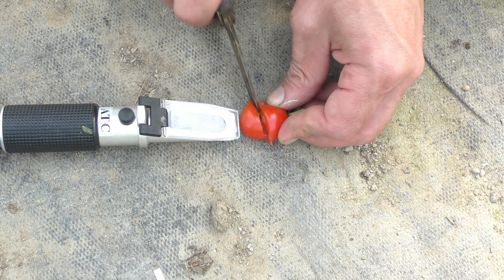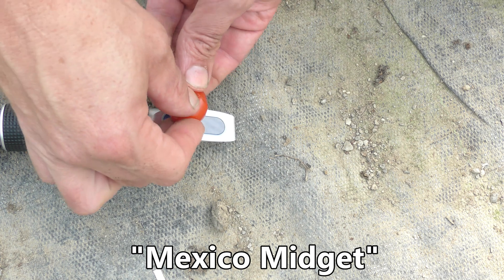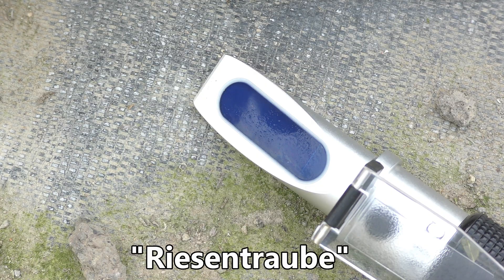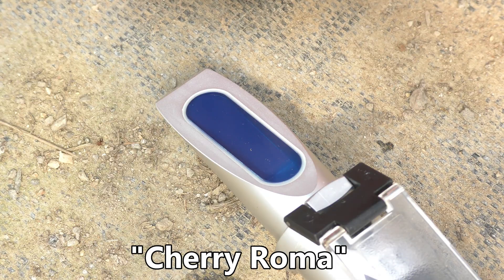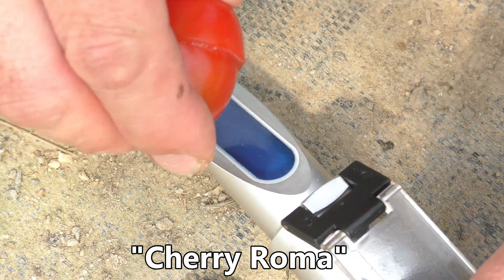First up is the Mexican Midget, and that's a reading of nine and a half. Next up is the mystery one that starts with an R — that one's pretty low at six. Last up is the Roma, which is my favorite, and that's at about 10.